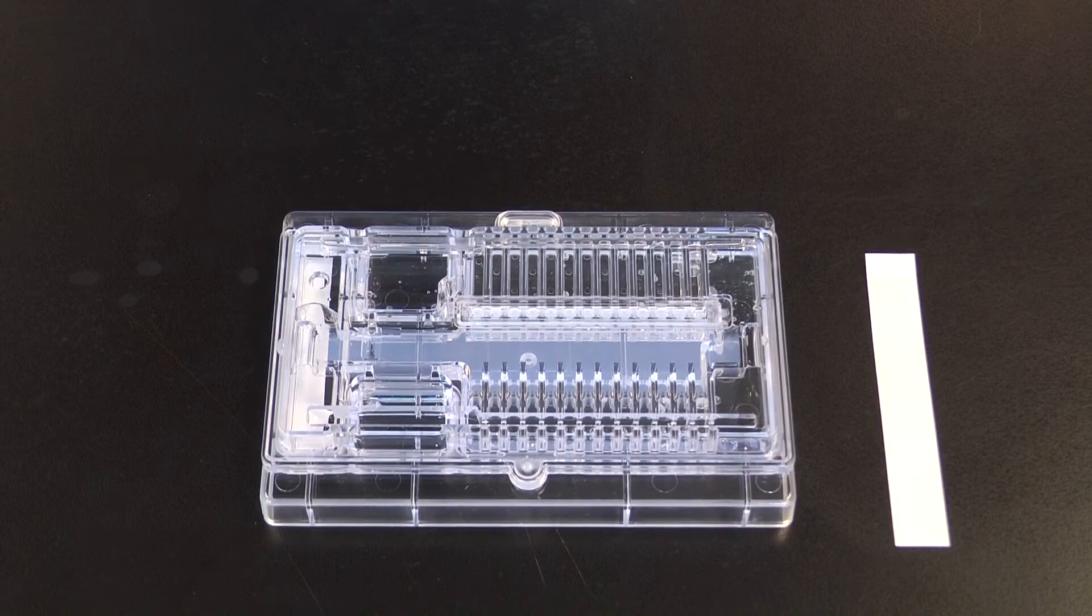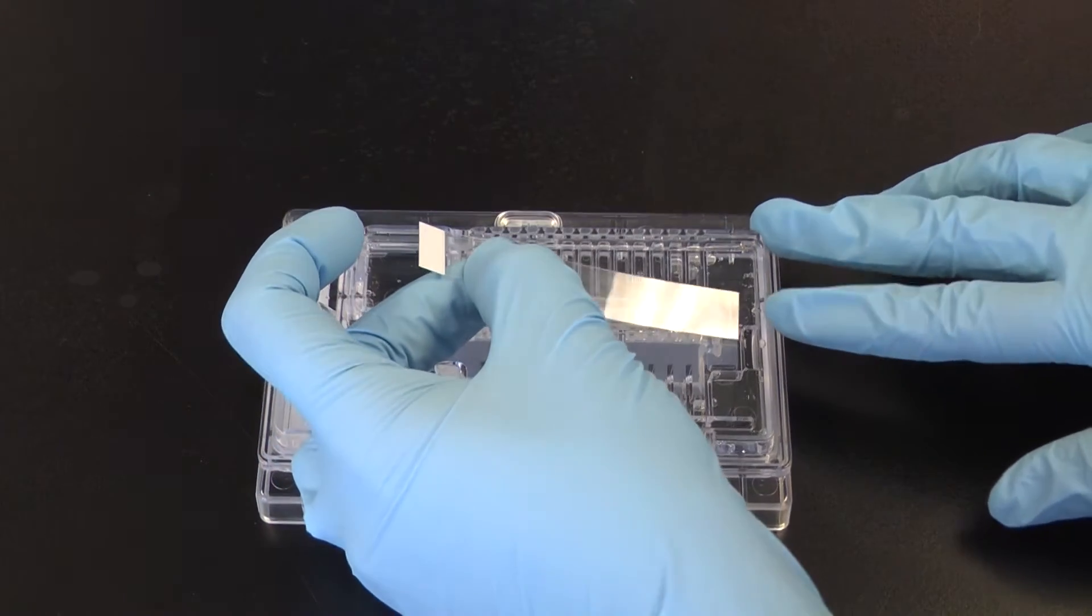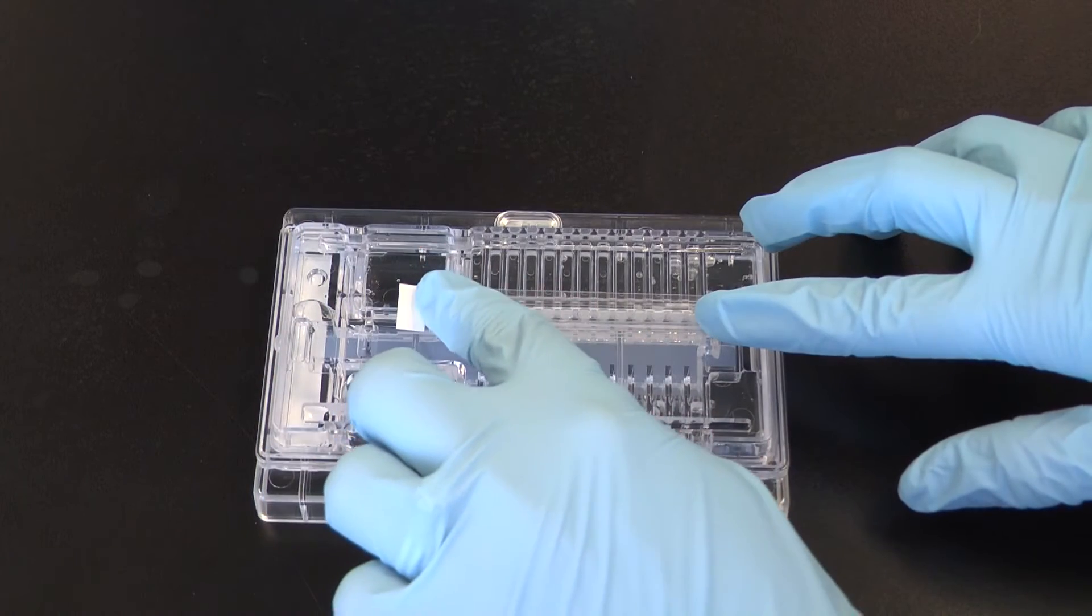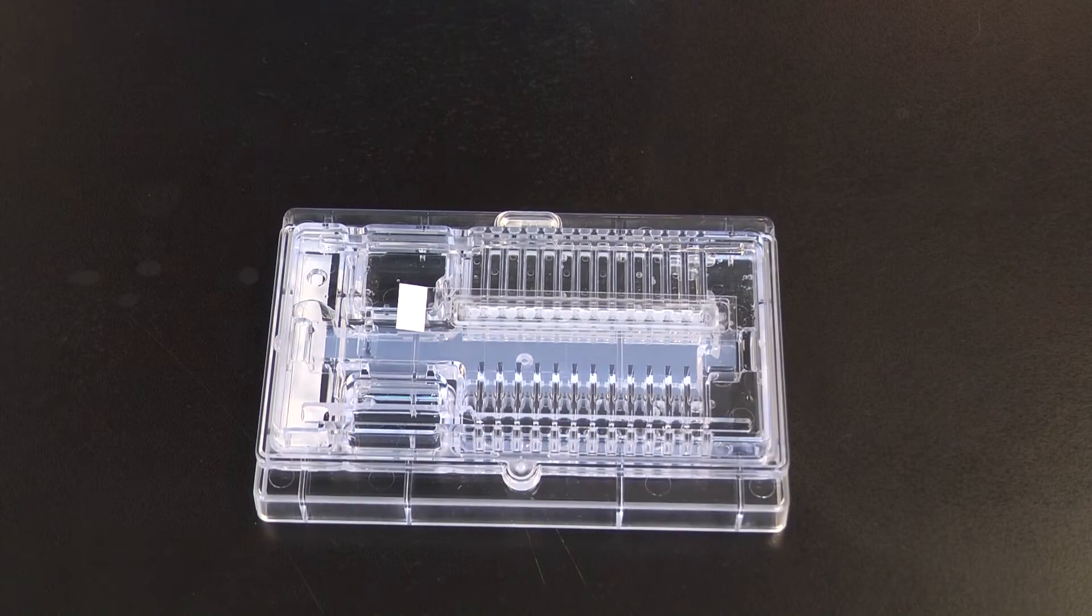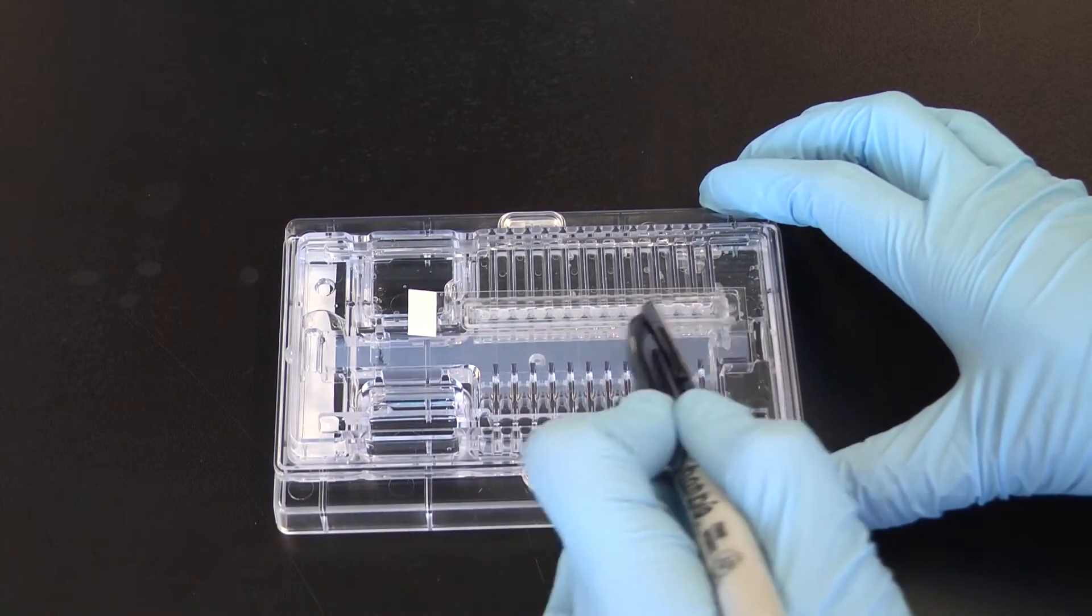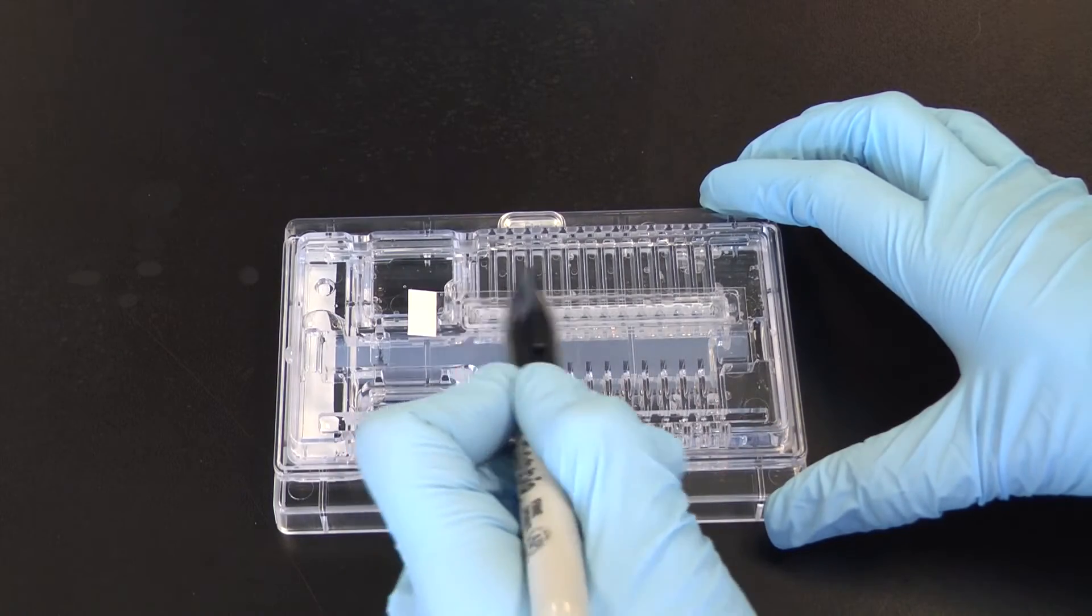Seal elution modules with the pressure sensitive tape provided. Take care not to obstruct the lower electrode port with tape. Firmly rub the tape with a finger, then secure the seal using the back end of a sharpie or similar object. It is important to ensure a complete seal on the elution ports.